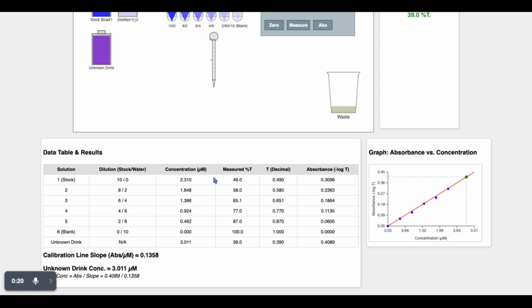By completing this procedure, we demonstrated that spectrophotometry is an accurate method for determining the amount of dye in a solution. This experiment reinforces that absorbance increases with concentration, and the calibration curve is an effective tool for analyzing unknown samples.